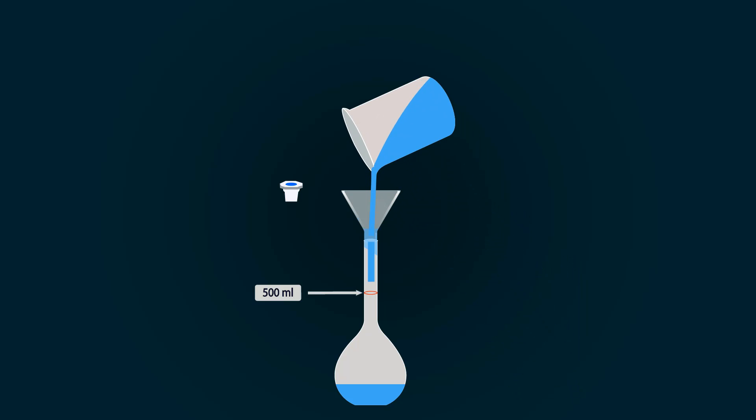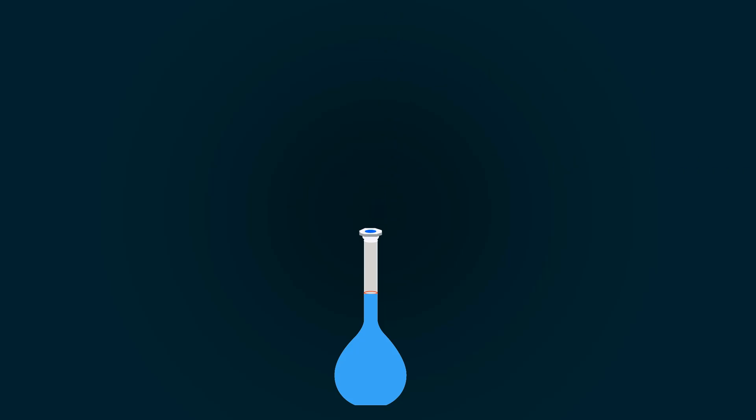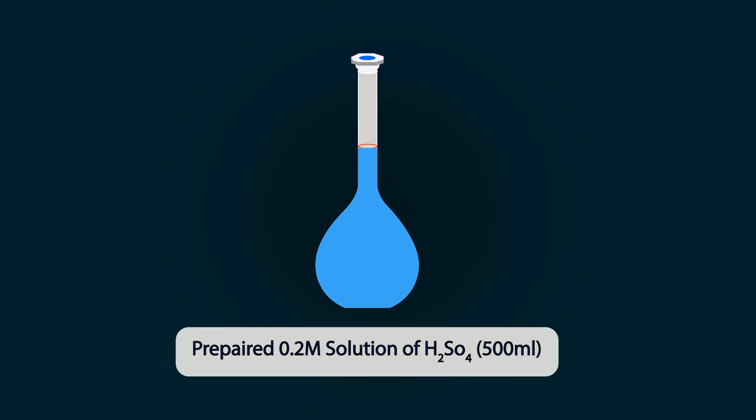Now add distilled water up to the 500 milliliter mark. Close the measuring flask and you will get 0.2 molar solution of H₂SO₄. You can store it in any bottle you want.